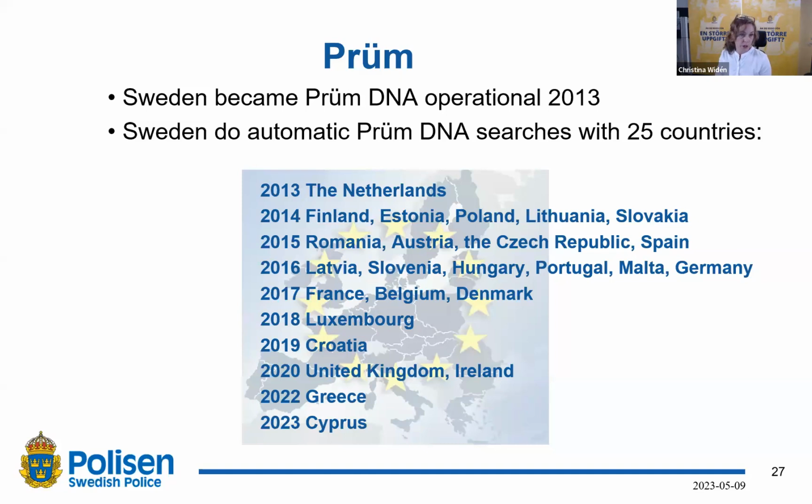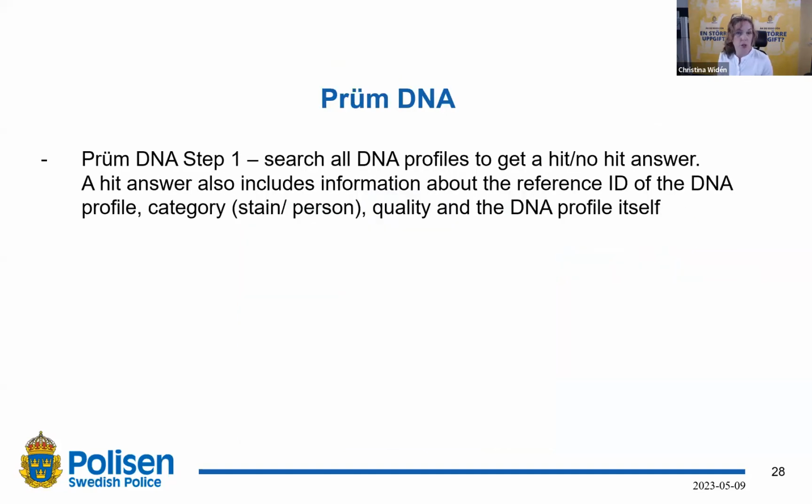And how it works, you send all your DNA profiles to a new country to get a hit or no hit answer. And first you send all your stains, and from next day, you send all your new profiles from stains and suspect or convicted offenders.